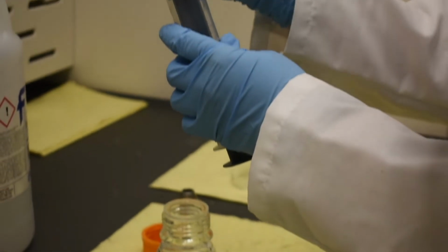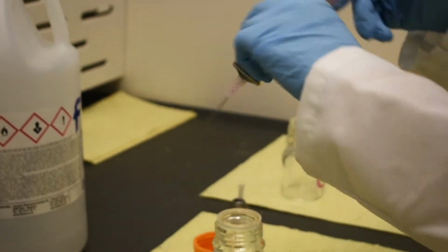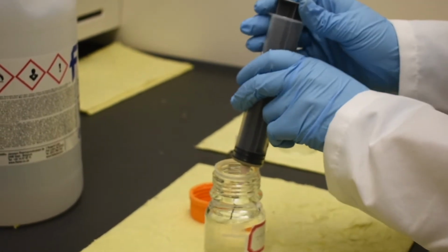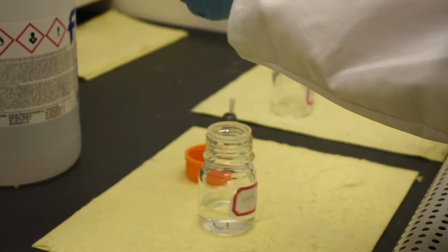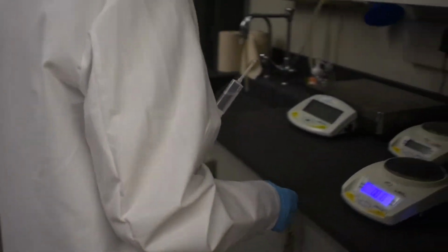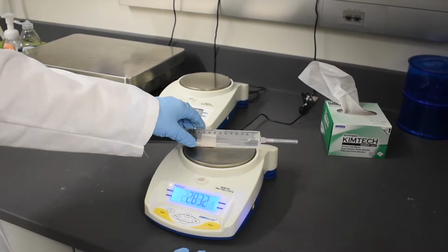Next, draw around 50 milliliters of the solvent out of the smaller container using a 60 milliliter syringe. After the desired amount is attained, recap the syringe. Next, record the mass of the solvent-filled syringe.